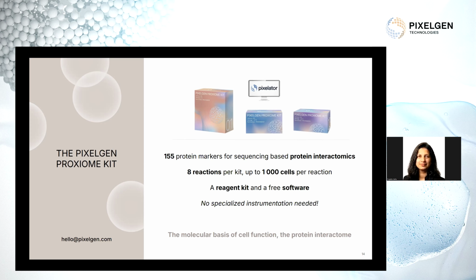By the time, I can just ask a very general question about the resolution of our technology and the product. How is it in comparison to other technologies? It's a little bit difficult to assess exact resolution, since this is not really a microscopy technique. We don't take images of the cells, but rather we detect unique molecules on the cell surface, and we detect them if they are close to each other, so to say.